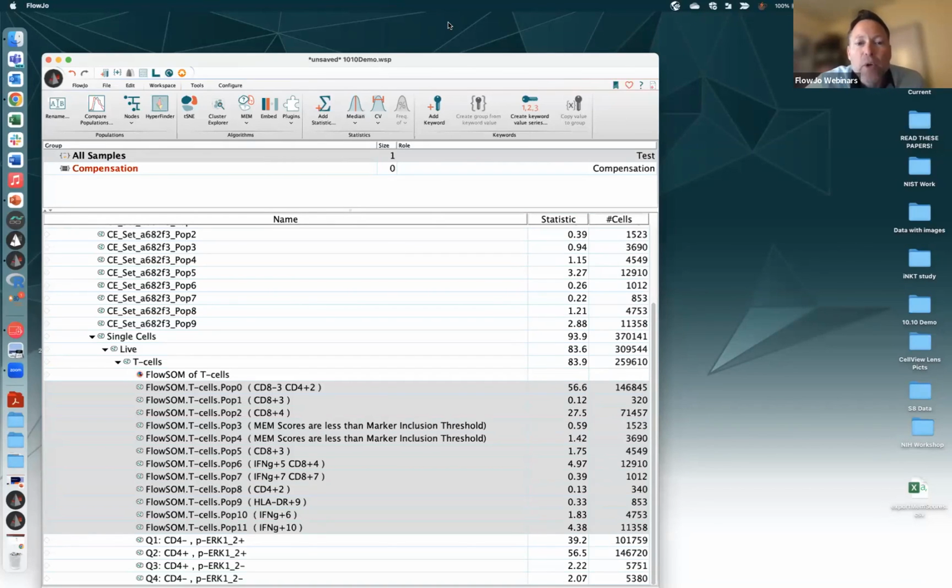Okay, we have some questions about the quad merging tools at the end. Yeah, in fact, I'm just going to say that right now, since quad merging, I believe you assume is in MEM. So the idea here is that for our MEM scores, there is a merge nodes based on the MEM score. So the MEM score is trying to tell you what it is that this cluster is. And so if you end up with 2 populations that say have very similar or exactly the same MEM scores, maybe those should be joined into one cluster.